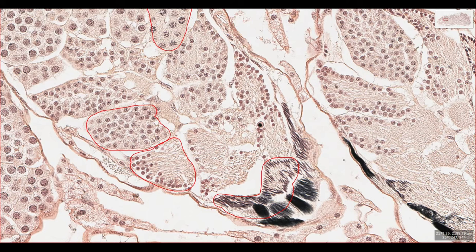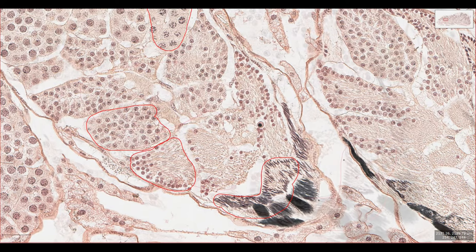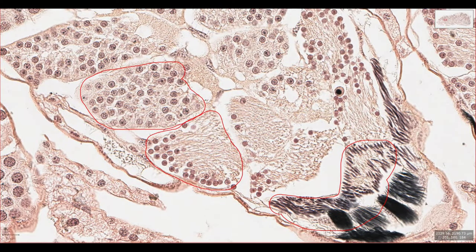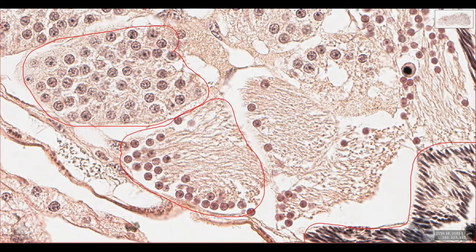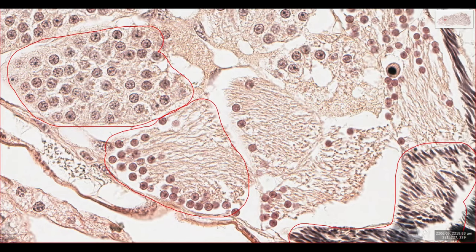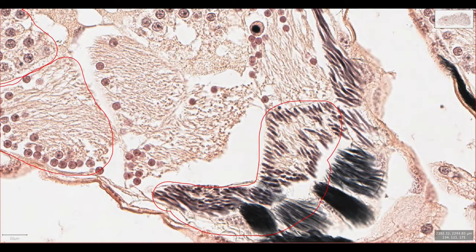You can clearly see the changes that occur as the spermatids mature. This section represents newly created spermatids — they are disorganized within their cysts and have larger nuclei with one or two nucleoli, which you can see as dark spots within the nucleus. As they begin to mature, the nucleus shrinks and the spermatids organize around the cyst's periphery. The chromatin in the nucleus begins to condense and the nucleus goes from a round to a needle-like conformation. The cytoplasm of the cell also begins to shrink and a flagellum is constructed at the opposite pole to the nucleus.